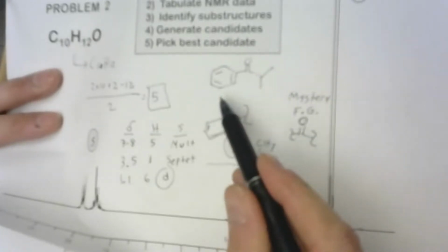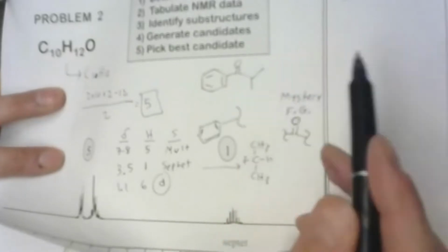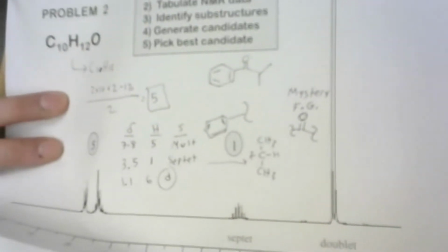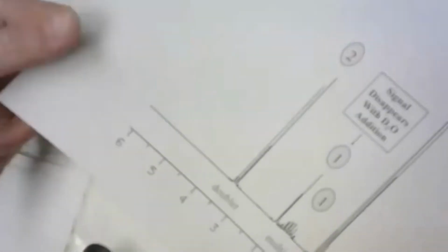That's our final answer. Okay, I'm going to try to sneak one last problem in just to get us ready for next time. And if you have to go, you can watch the recording. But I just want to get through one more because once you start seeing this, it just sinks in. So we'll do a quick one. All right. Okay, and I'll expedite this a little bit.